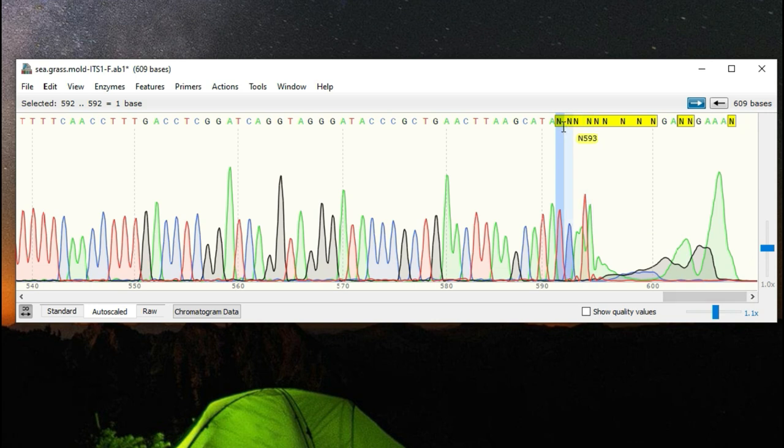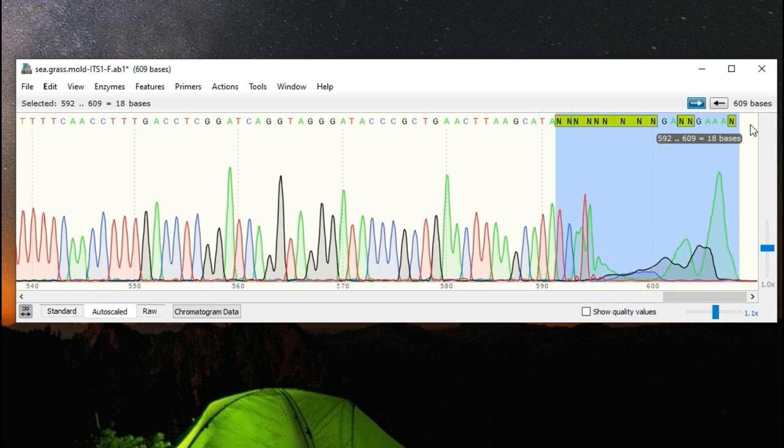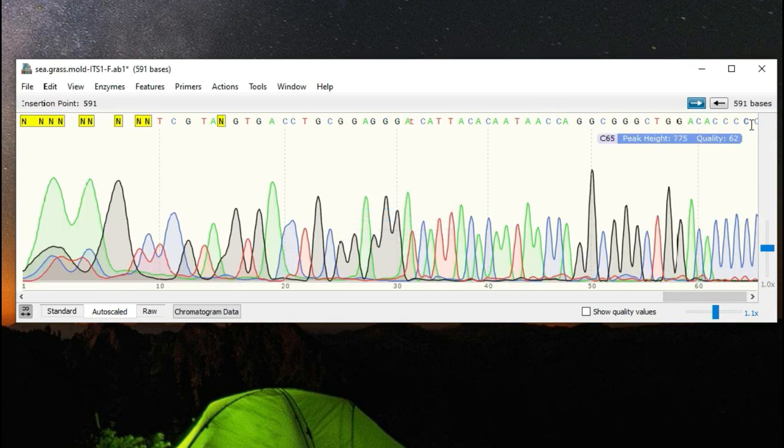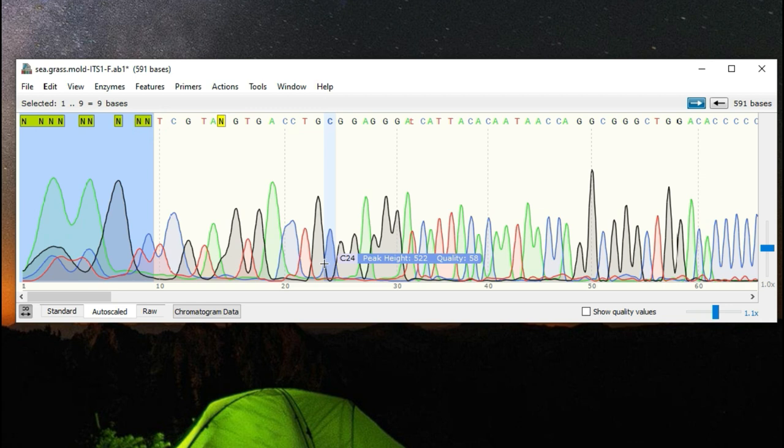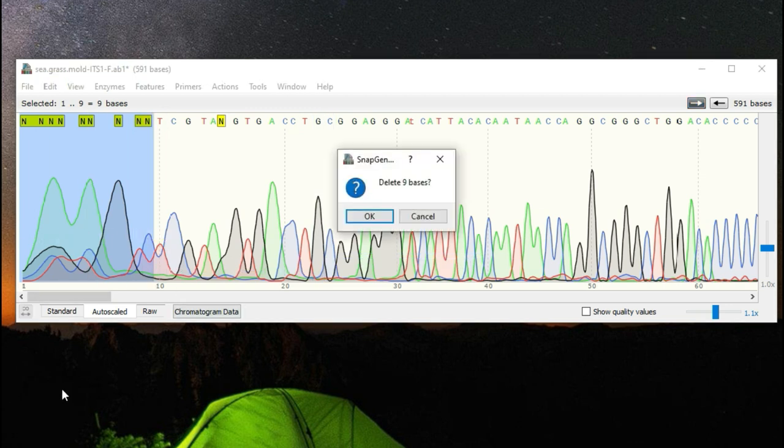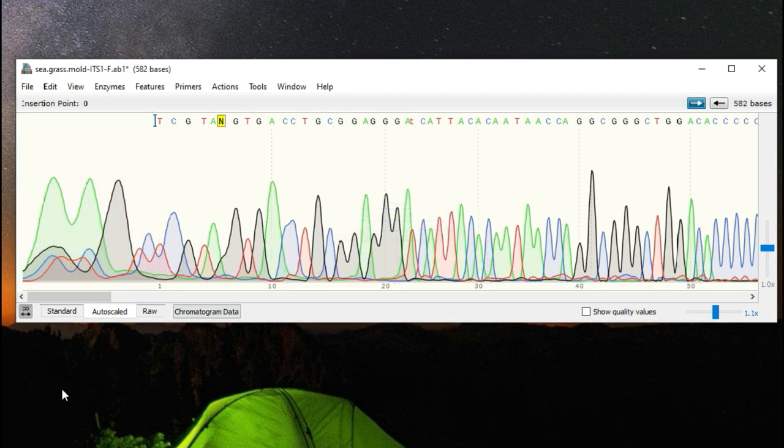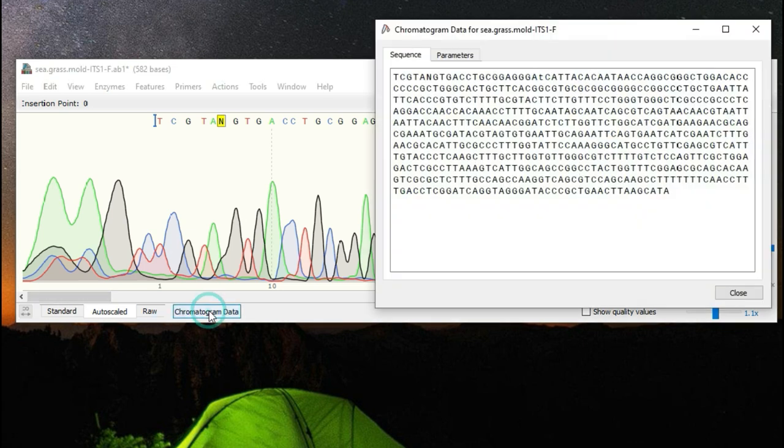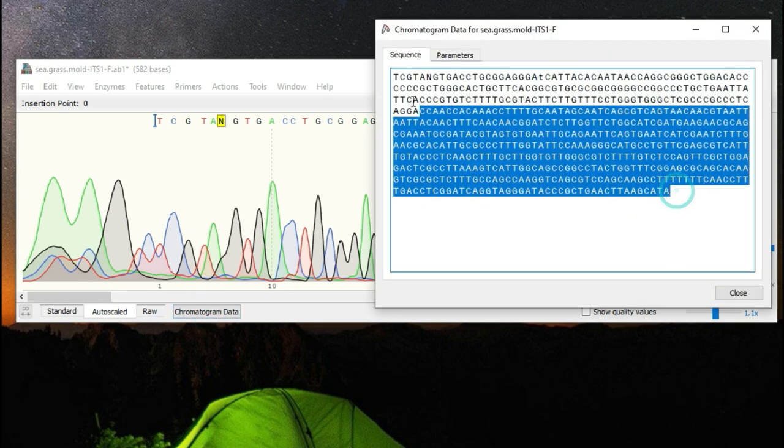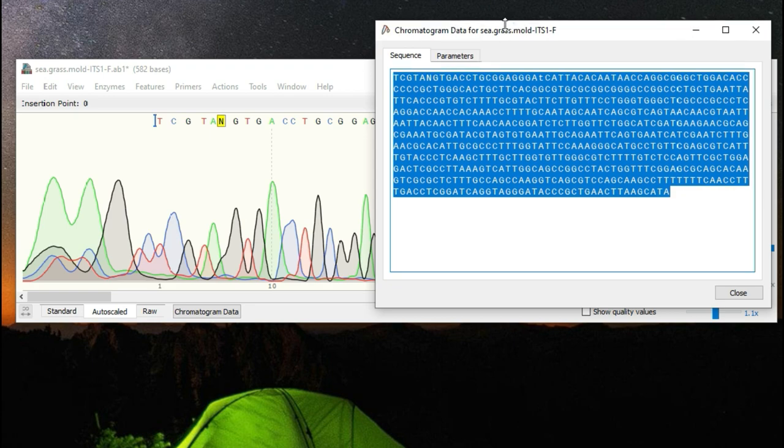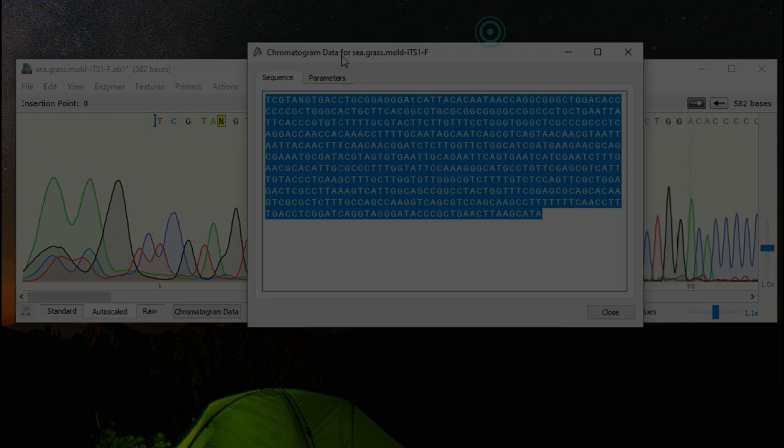After you've annotated any of the ambiguous bases you can go ahead and trim off the ends of the sequence typically starting off with the innermost n value highlighting the n section and hitting delete. Once this is done the underlying sequence data will be updated and be able to go ahead and start using the blast tool to see if our sequence matches any species of known type in genbank.